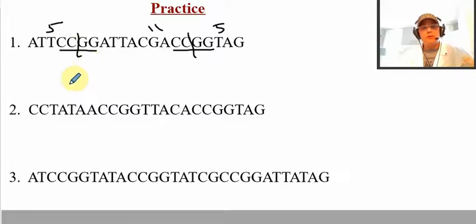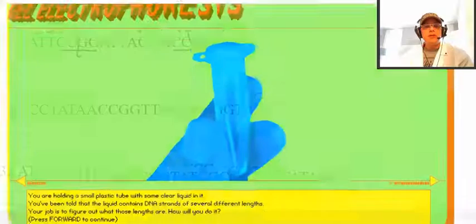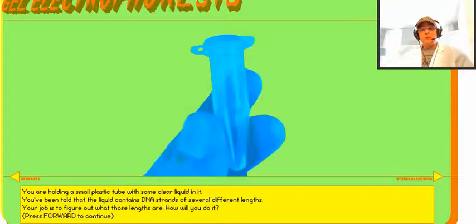You have to use some tricks. And for that, I'm going to move to this website and show it to you. I'm showing it to you in this way because flash animation does not work on most devices that you all have. So let's go through this virtual lab together.